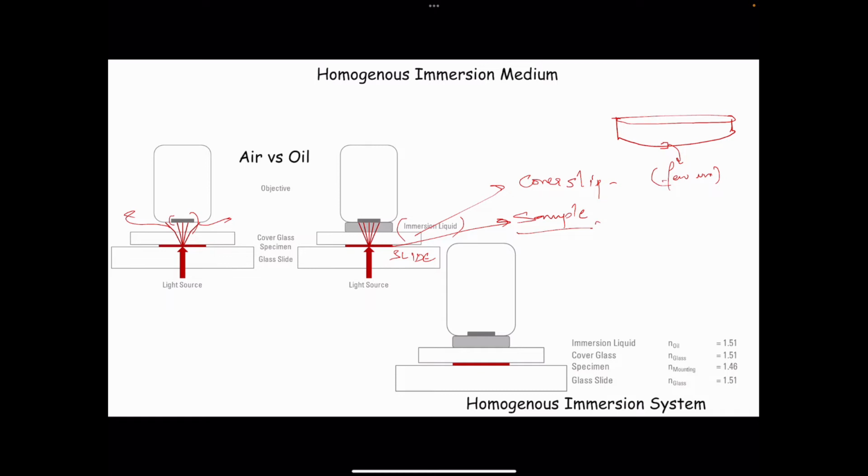Now, to maintain viability, most living preparations, in the case of animal cell culture, are mounted in aqueous solution and buffers, because if you keep these cells in the native aqueous or buffered condition, the native integrity of these cells is maintained, at least to a partial extent.